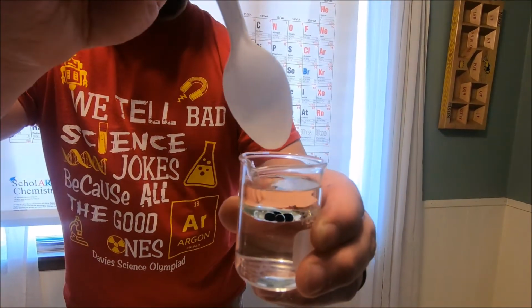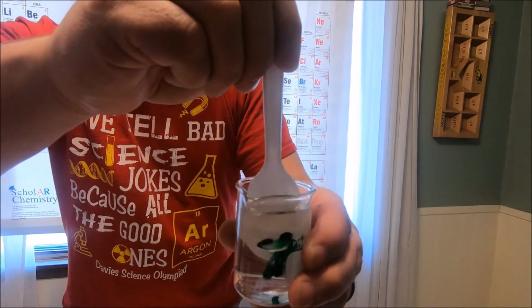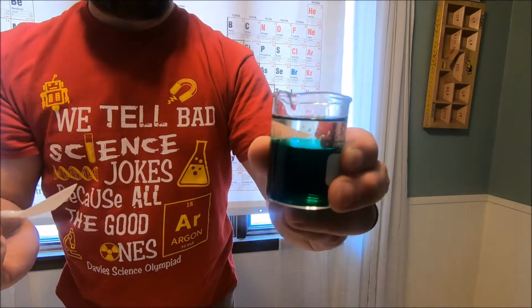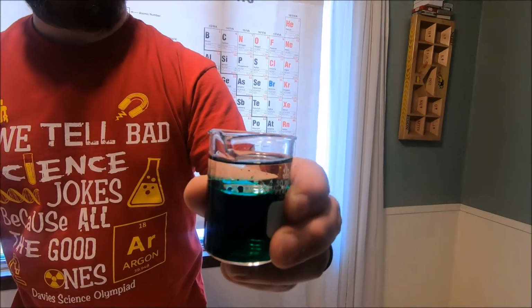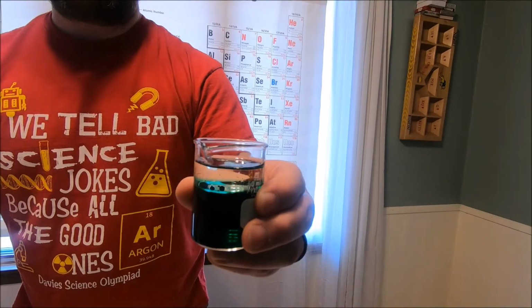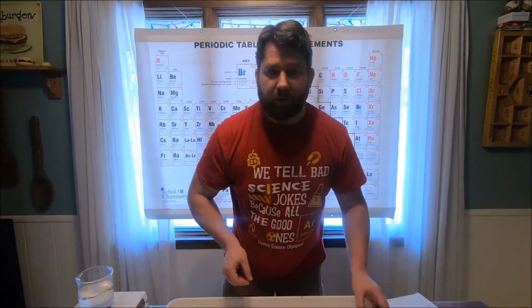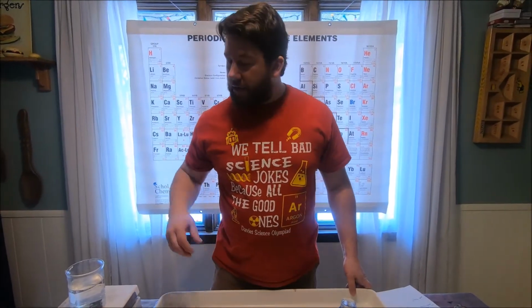If we get that water and the food coloring to touch though, it quickly starts to dissolve into the water, so that we can see that layer of oil. No green, but that water has now dissolved the food coloring, so the water and the food coloring, like dissolves like. That food coloring wants to dissolve in the water, not in the oil. So that's going to be one of those ideas that we look at, oil being a nonpolar substance, water being a polar substance. Now from there, what we're going to be looking at is how different rates of dissolving occur.